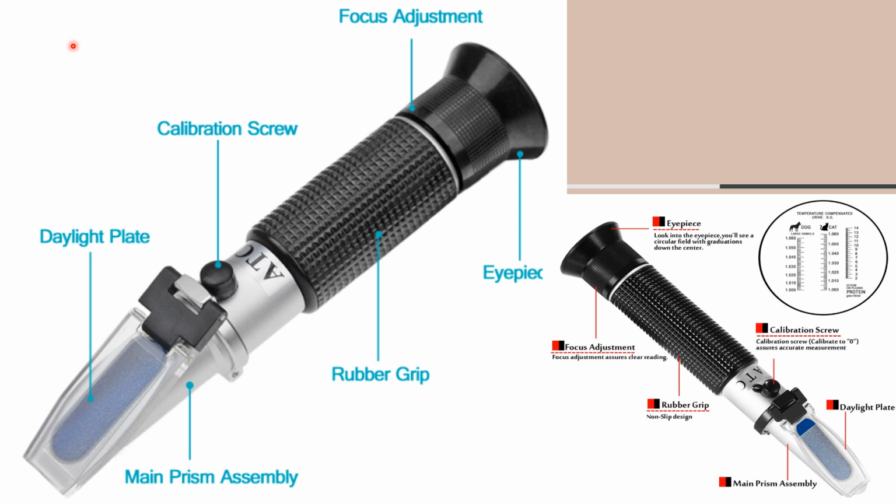You ensure a proper light source and avoid excessive ambient light interference accordingly. So that is for your refractometer. Again, daily calibration of this one, and you clean before and after every use.